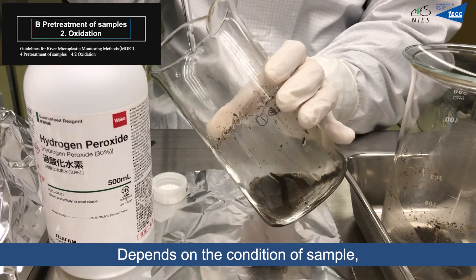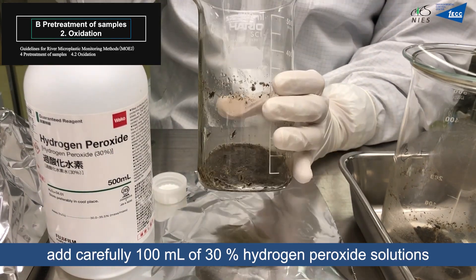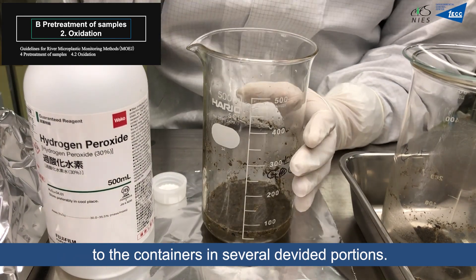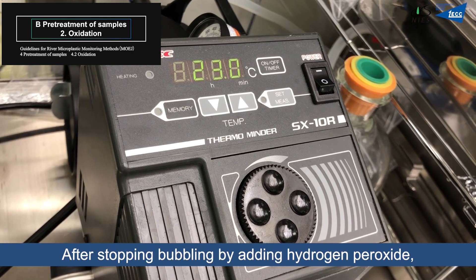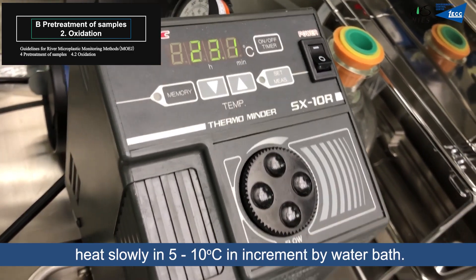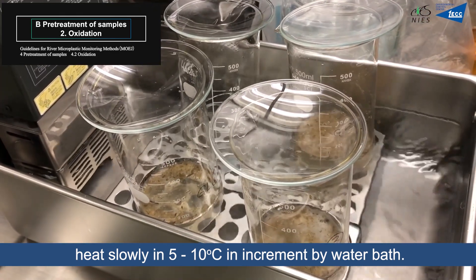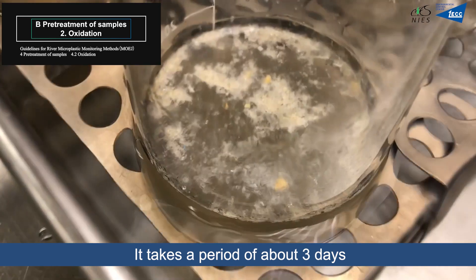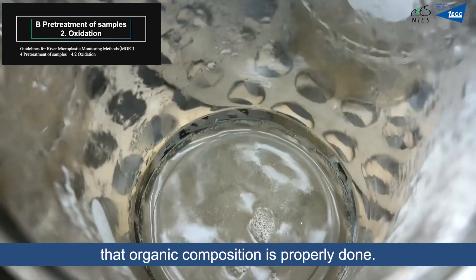Depending on the condition of the sample, carefully add approximately 100ml of 30% hydrogen peroxide solution to the containers in several divided portions. After the bubbling stops following the addition of hydrogen peroxide, heat slowly in increments of 5 to 10 degrees using a water bath. Organic decomposition is properly completed over a period of about 3 days.